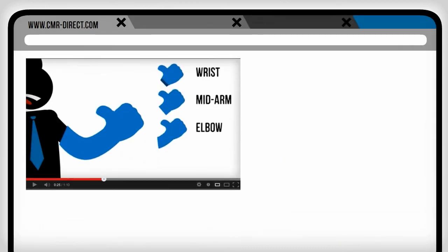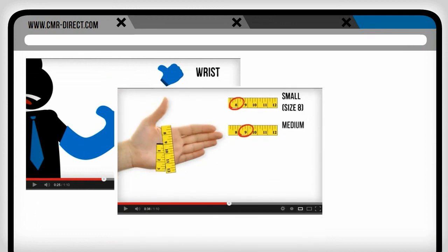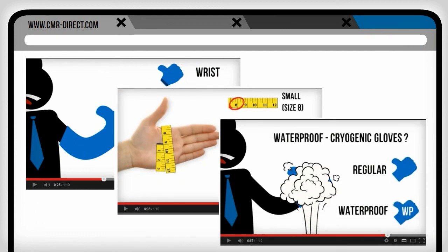With our videos, we'll help you select glove length, get the right size for your gloves, and explain why you might want a waterproof glove.